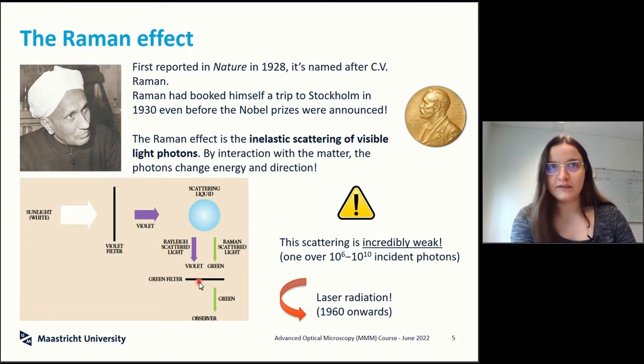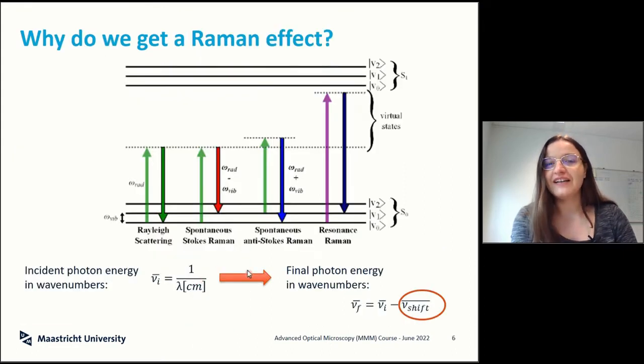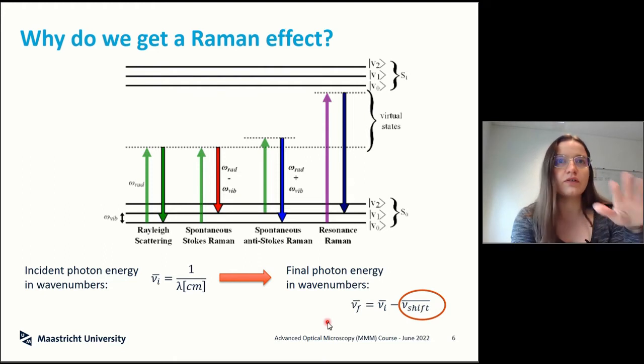So if we were to look at this from a point of view of energy level, please don't be scared. I promise it's nothing scary. But energetically speaking, molecules tend to stay at a series of ground state energy levels. So every molecule that you have around you at normal conditions, which we are at the moment, has a stable ground state. Of course, if you were to cool or heat the sample extremely, this will change, but in our normal condition we can identify a ground state of the molecules.